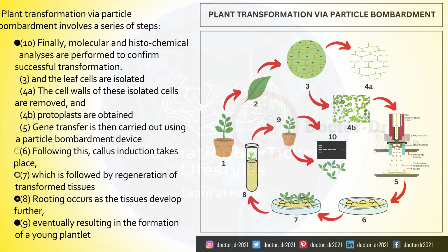Advantages of microprojectile bombardment. Microprojectile bombardment is a fast and relatively simple method for delivering desired genetic material into cells. It allows the delivery of large nucleic acid fragments. The method is not limited by host specificity or species, making it widely applicable.